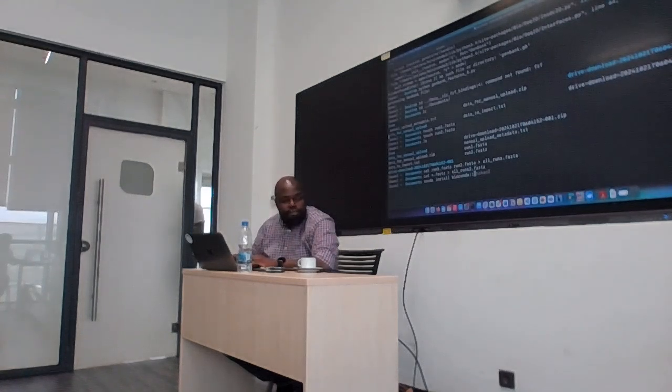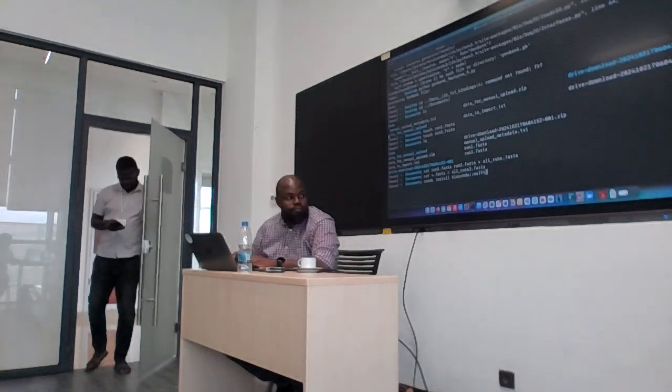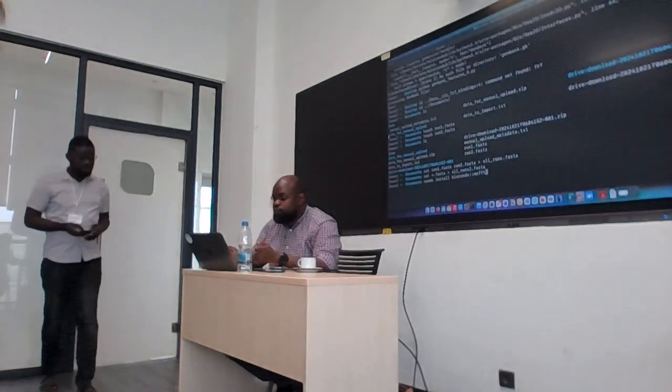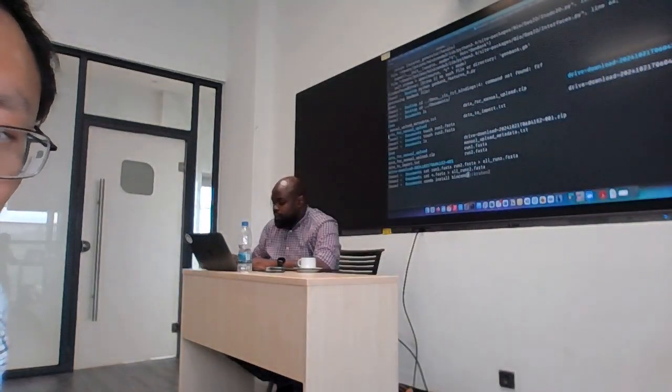Would you use the -c option or? I also put it in your Slack. You should have the same messages. So there are different ways you could do this. You could do that, or you could go the option where you specify the channel.